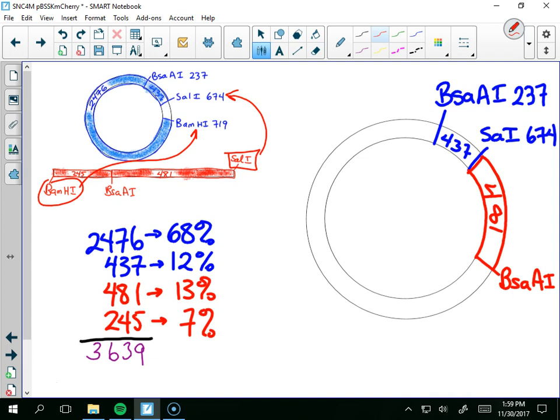From before, about there. And what we can do even is go over them in purple, where they join up. Cell 1.